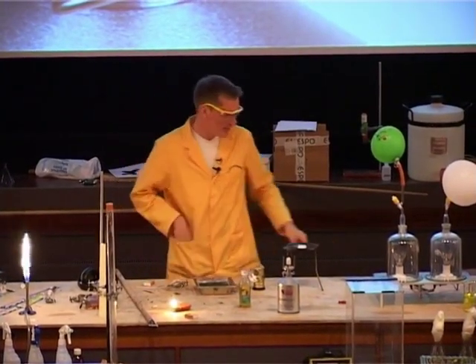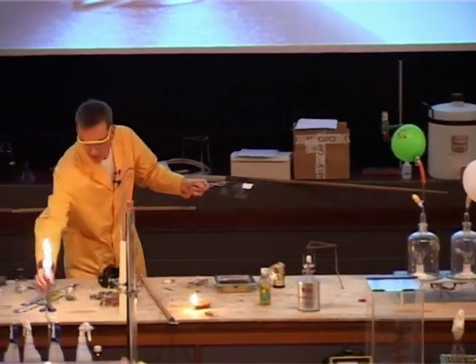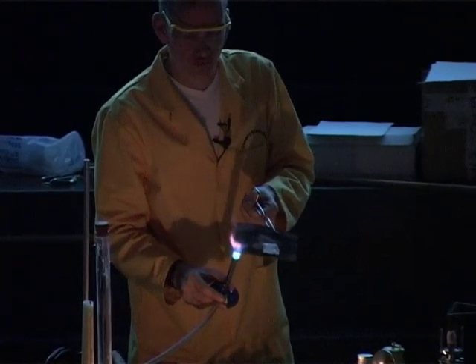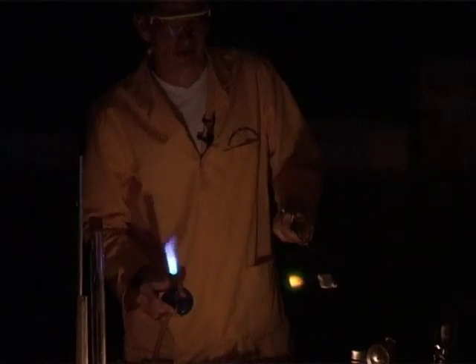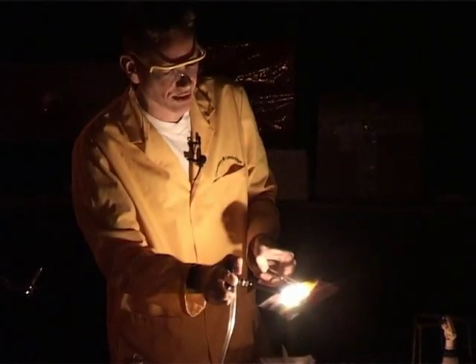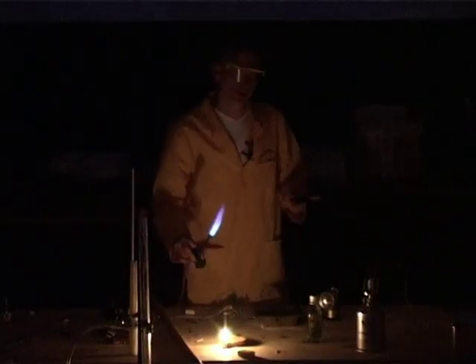Well, let's see if we can get one of these to work. I've got a mantle here. So here is the mantle from one of these lamps. And just with my Bunsen flame, first of all, let's just try and heat up the gauze. So my Bunsen burner can get things red hot. So a metal or something like this glows, but it only glows red hot. There's not really very much light coming out of that. But these oxides, these particular compounds, when heated, give out a really, really brilliant white light. So this is much better at converting the heat energy into light. But only certain compounds will do this.